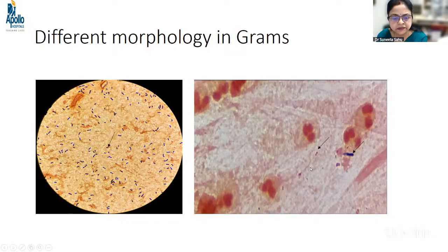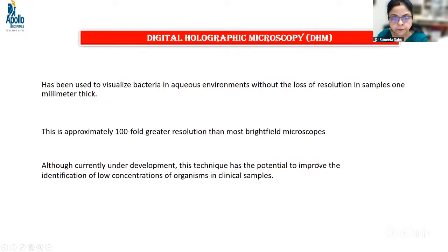All these things will give us an idea about the sample, whether the sample is properly collected or not, or whether the sample has been contaminated during collection, and what the pathogenic organism is, which type of organism is present in more amount, or which type is present in lesser amount. So all these different types of information we can get with the help of the gram stain.